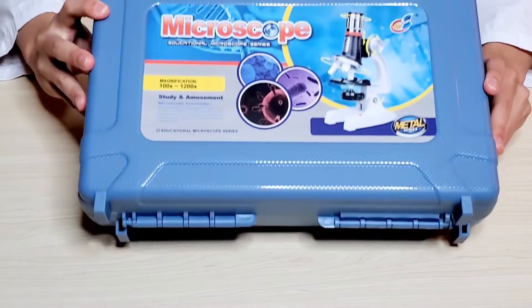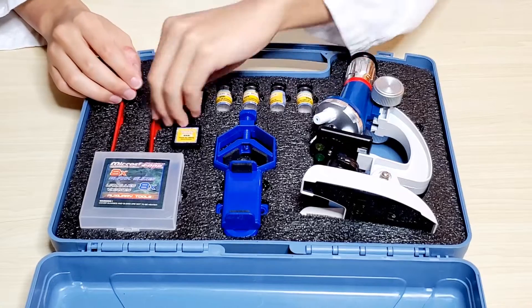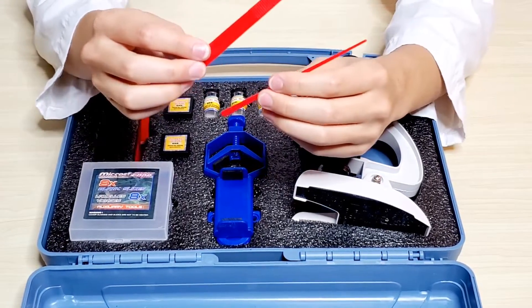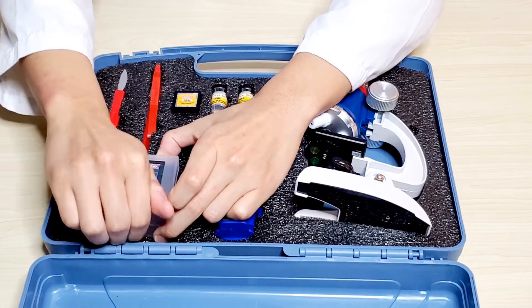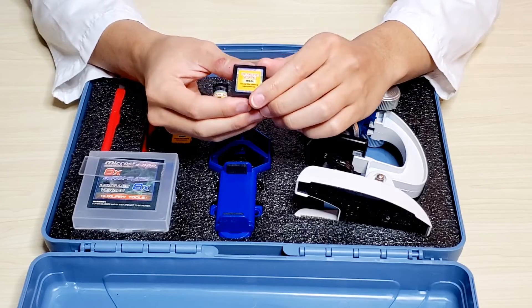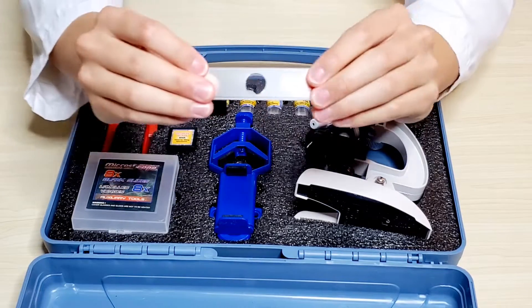The micro world drawing kit consists of a microscope, collection bottles to collect your specimen, and tools to help you collect the specimen including tweezers and a spatula. It also comes with a plastic knife and a stick to help you collect samples, a phone holder you can attach to the microscope to take photos, empty sample slide glasses, and stickers that you can label your specimens. You take off a sticker, place it onto the slide, and just write the initial or a little drawing.